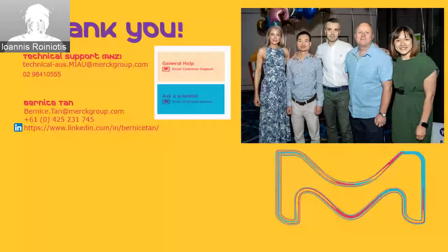Yeah, I think sometimes you use melt curve analysis for these. So I would like to get in touch to be able to answer your question a little bit better, but I would imagine you probably need a wild type or a disease versus non-disease to be able to look at the difference. Sure. Yeah, if that anonymous person can get in touch, that would be great.